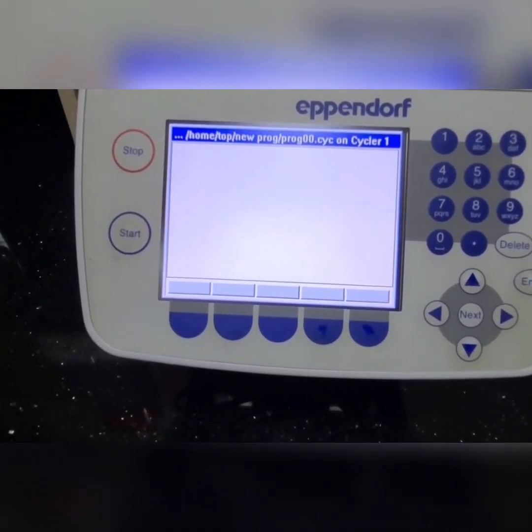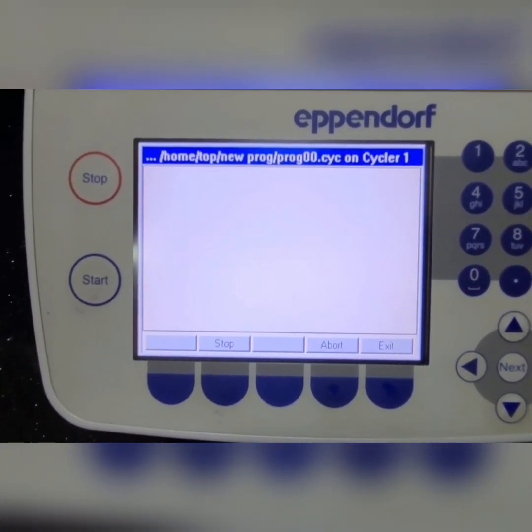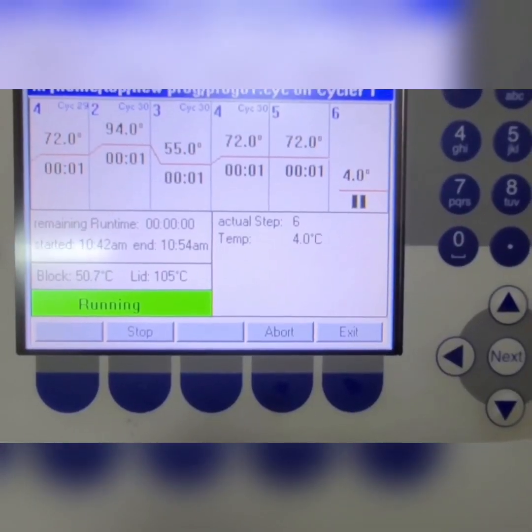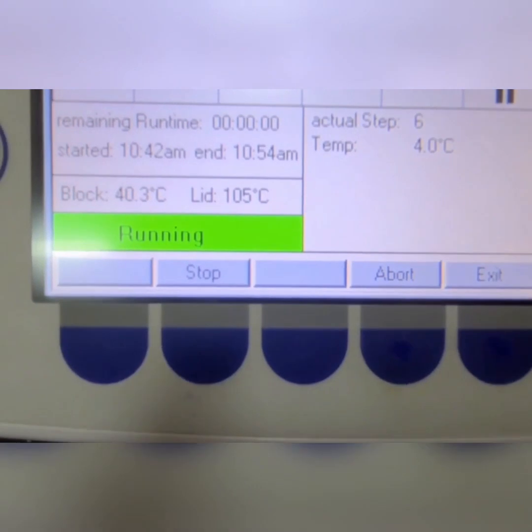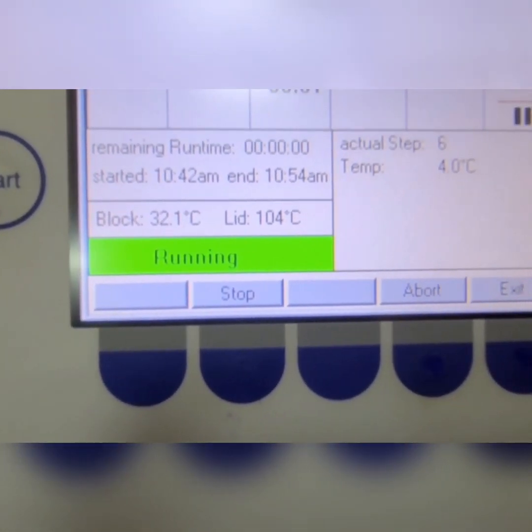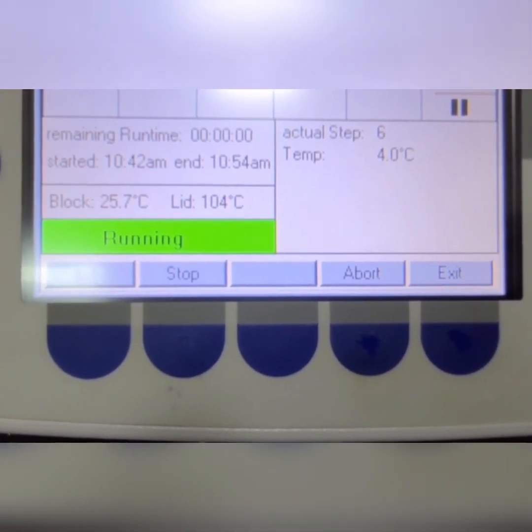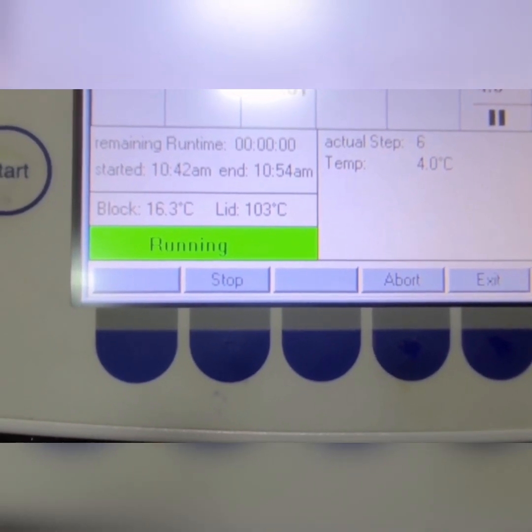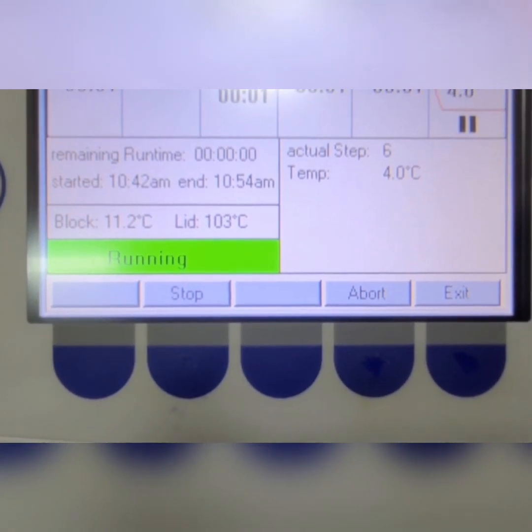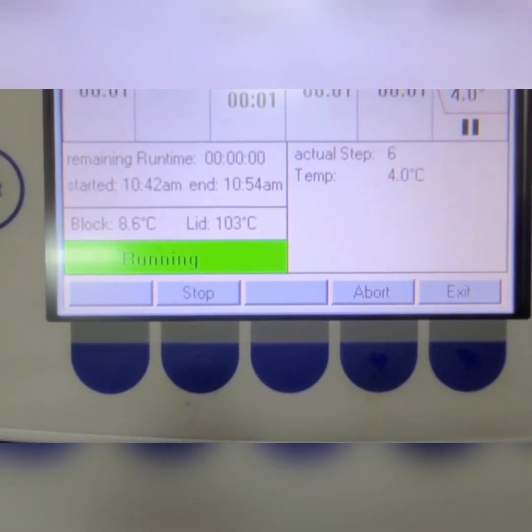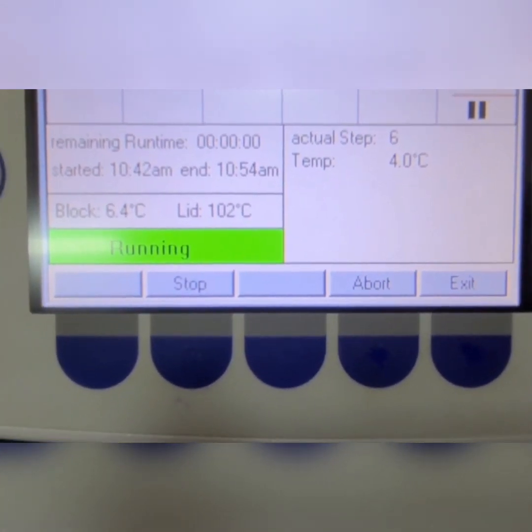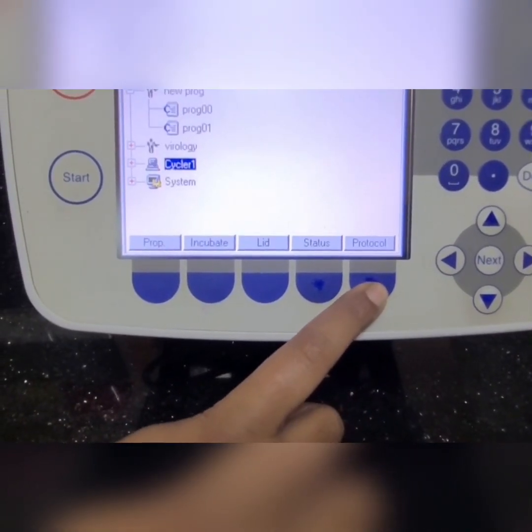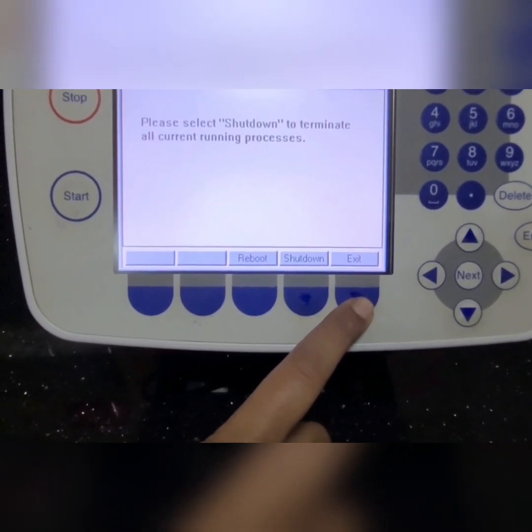In gradient PCR you can see multiple red lines in the annealing step when the program starts. At the beginning you can see the rise in lid temperature and block temperature — until those are reached you can monitor the screen. When the program ends, the remaining runtime will display as 0 and the block and lid temperature will start to drop. Once the block temperature reaches 4 degrees, 'Press Enter' will be displayed on screen — press the enter button. After this press the exit button, and you will see the option for shutdown. Click shutdown to turn off the machine.